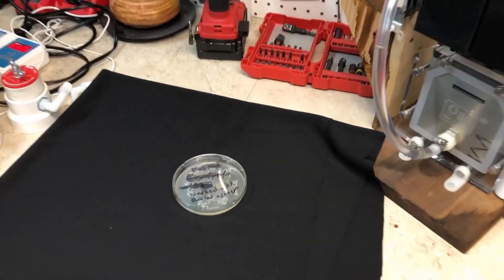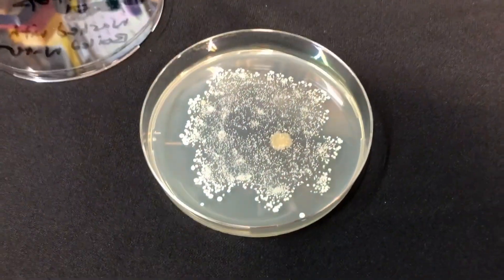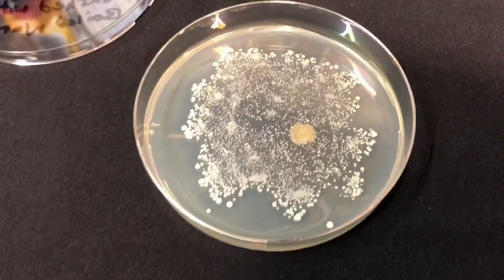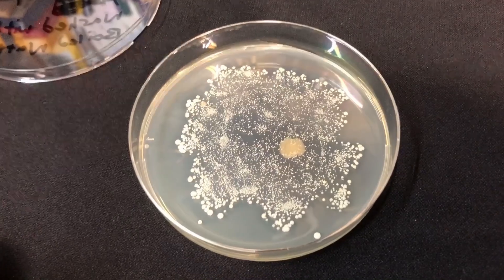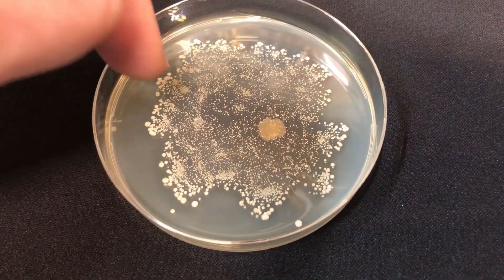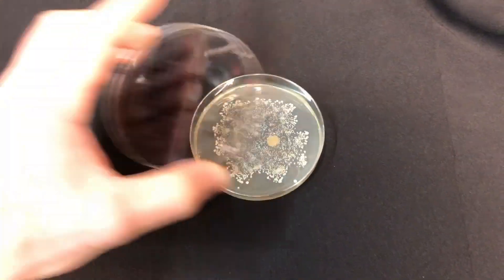It's been four more days since I washed my hands with foam soap and rinsed with boiled water, and here are the results. You can clearly see there's not a whole lot of difference versus the other petri dishes in this video. The main difference I can note is that there doesn't seem to be as wide a variety of things growing — mainly just two types of organisms: some white specks and a brown blob. The other petri dishes seem to have a bit more variety growing on them.